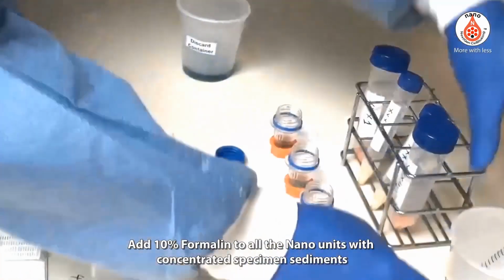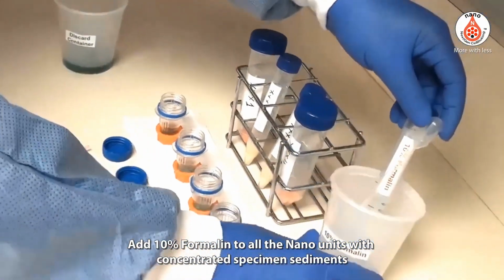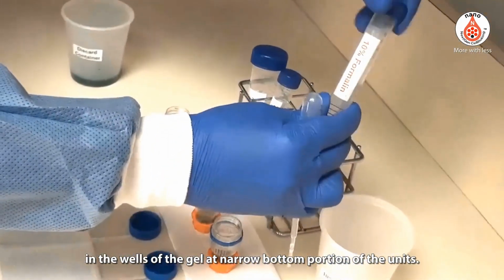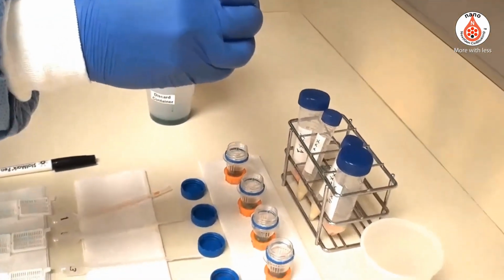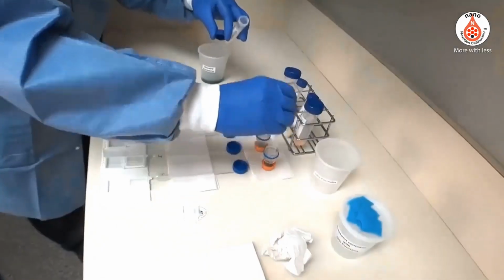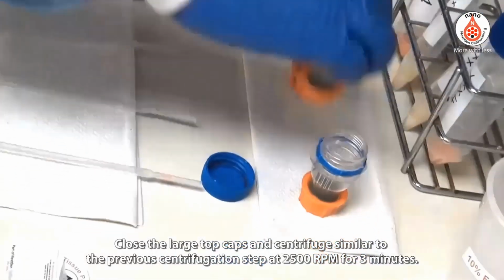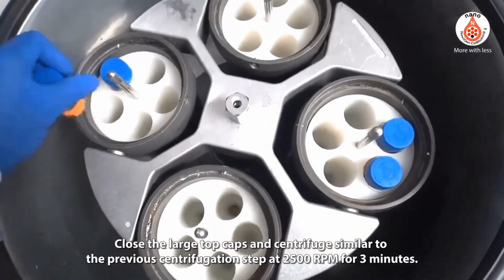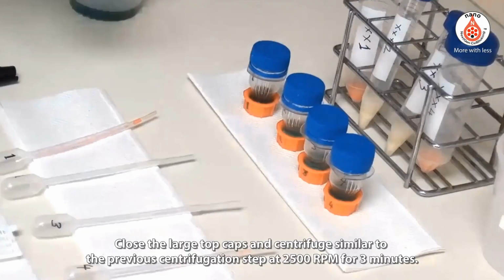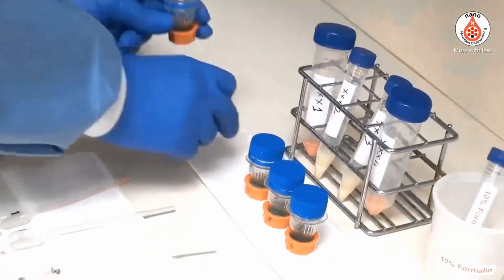Add 10% formalin to all the nano units, with concentrated specimen sediments in the wells of the gelatin narrow bottom portion of the units. Close the large top caps, and centrifuge similar to the previous centrifugation step, at 2500 rpm for 3 minutes. Pour out the supernatant into the discard container.